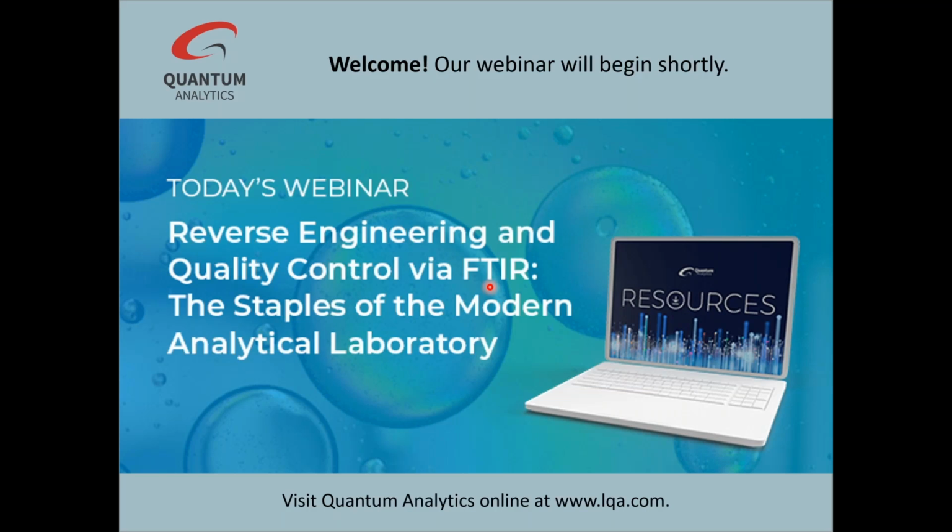Today, we will be exploring reverse engineering and quality control using FTIR, an absolute staple in the modern laboratory.